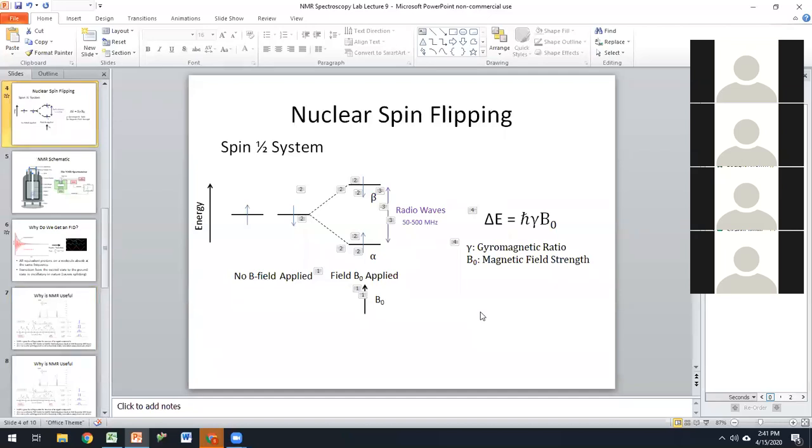It's a question in the lab: is C, the 13 isotope, more or less receptive as a nucleus, compared to hydrogen? Then I think what you should be thinking about is the paragraph before that question that talks about what makes a good candidate for an atom that we would look at in NMR.